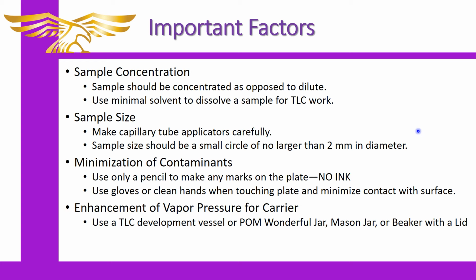It takes many, many tries and many, many plates of experience before you learn how to spot one and get just the right amount on the plate. So don't fret too much if you can't get that size limitation, but try your best to keep it as small as possible when you spot.